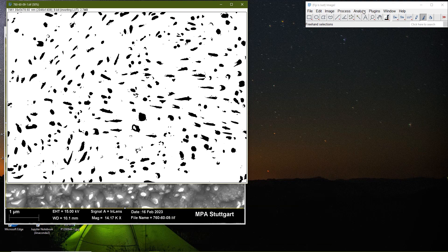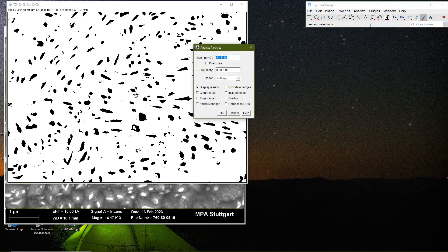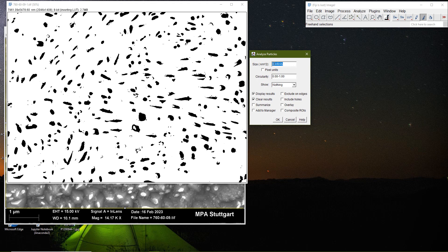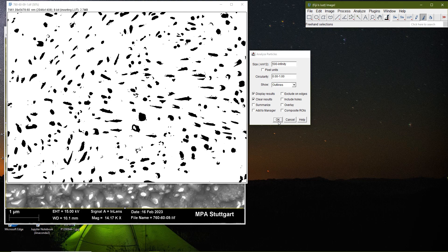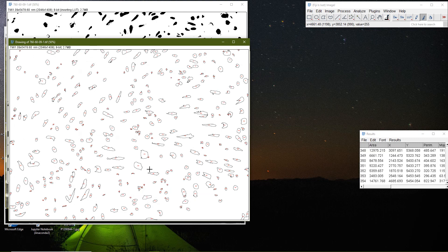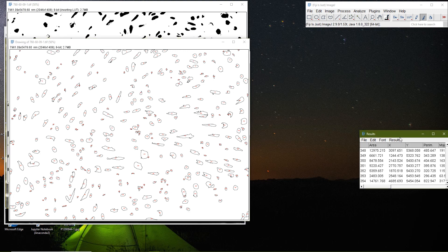Then I go to Analyze > Analyze Particles and adjust the size — not from zero, maybe from 500 nanometers to infinity. Circularity can be anything. I set Show to Outlines, clear previous results, display results, and click OK. It identifies each particle, shows its outline, and displays its measurements.